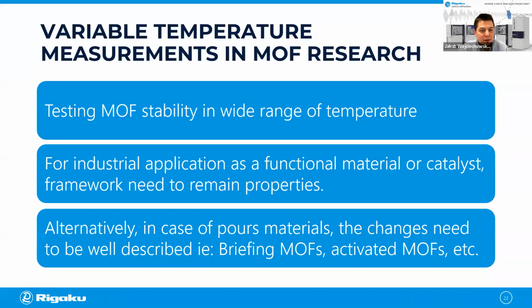So back to the topic, another very important technique or combination of techniques is variable temperature studies. And this is connected to testing MOF stability over a wide range of temperature. For industrial application of MOF as a functional material or catalyst, you need to prove that the framework will retain its properties. Or if you're dealing with porous materials like breathing MOFs, or you activate the MOF and you want to be sure that it's empty, you really have to describe that nicely also.